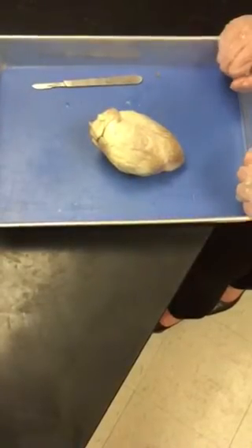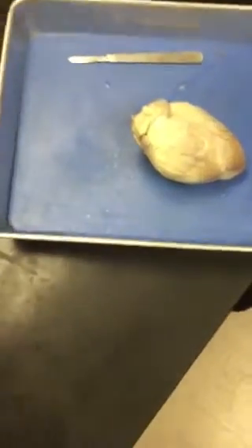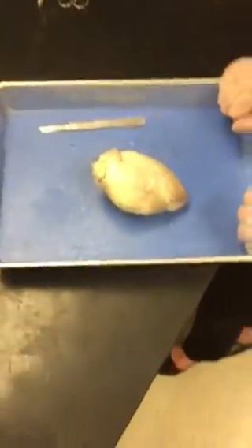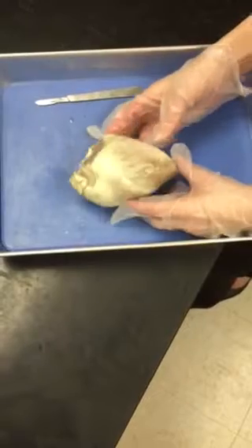Number seven, place the heart in your dissecting tray with the ventral side facing you. Refer to the picture in the manual. The ventral position means you would be looking at the person's chest from the front view.